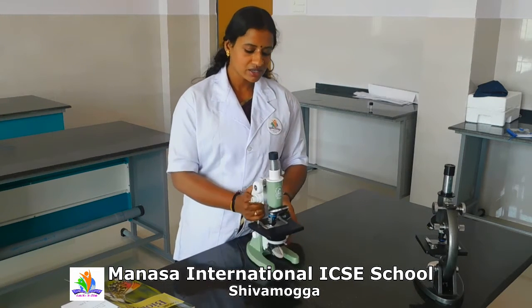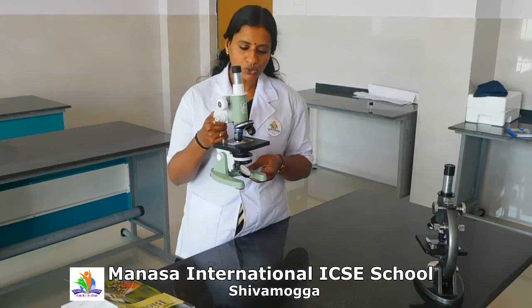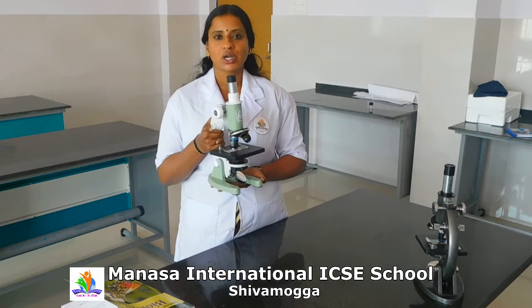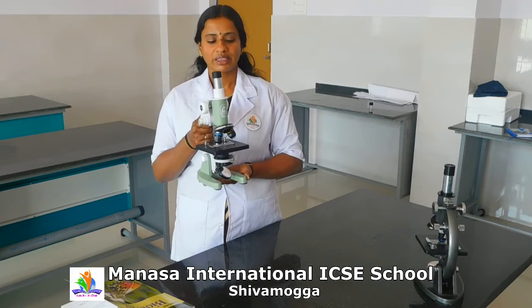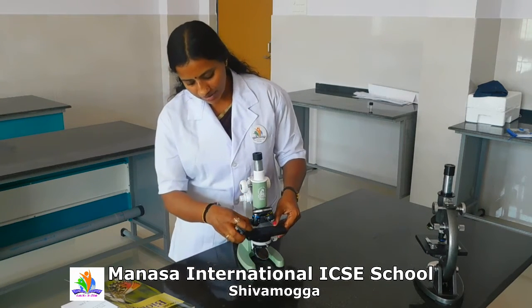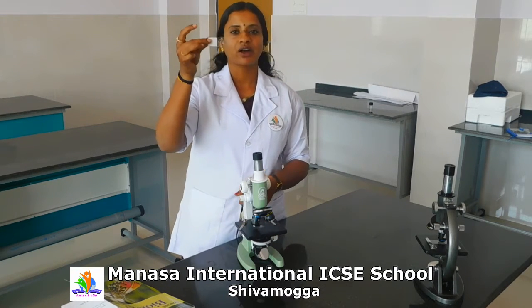Okay? This is the compound microscope which we use to observe the unicellular organisms. That too, they are preserved in the slide form. Okay, these are all the slides. They are called slides.